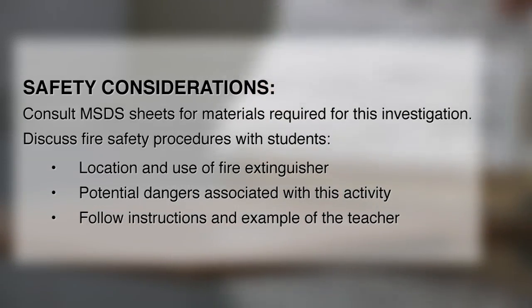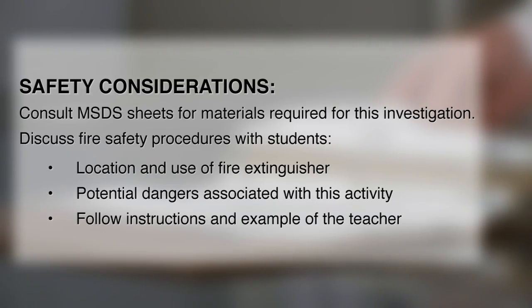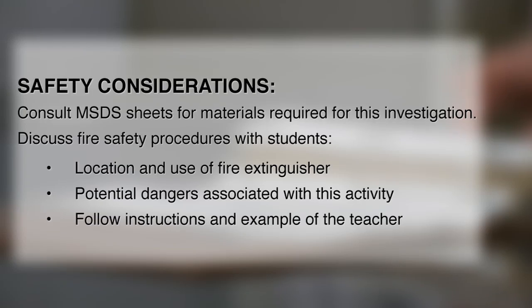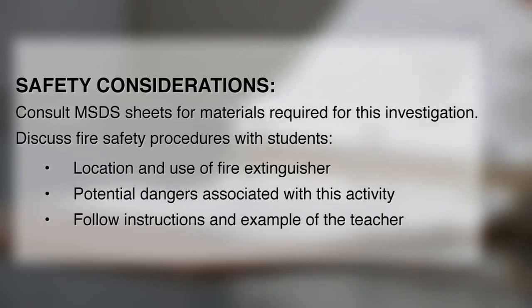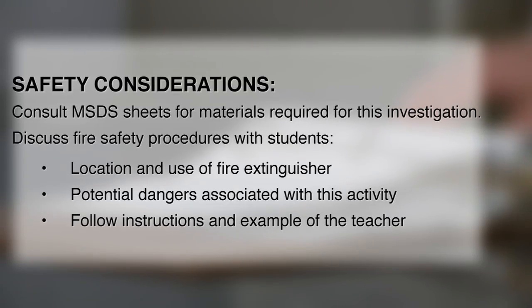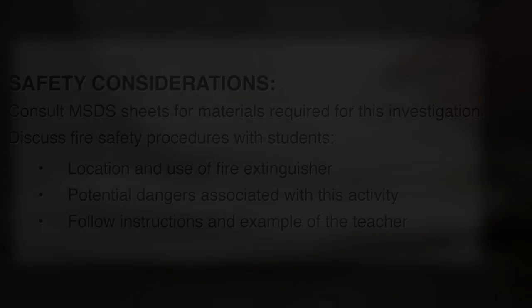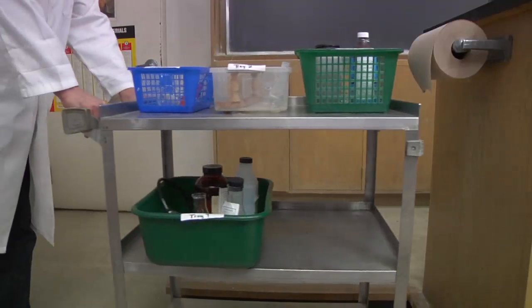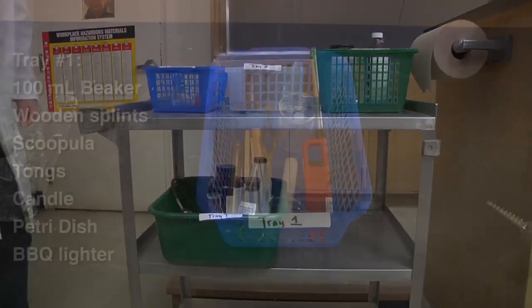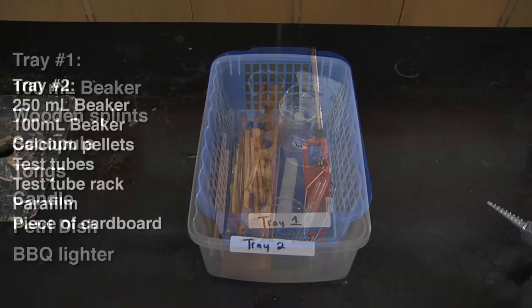Prior to beginning the investigation, teachers are reminded to discuss fire safety procedures with their students, including the location and use of the fire extinguisher, any potential dangers associated with this activity, and the need to carefully follow the instructions and example of the teacher. Prepare the investigation by having all materials needed on a cart that you can move into the classroom so that each group has the appropriate materials.